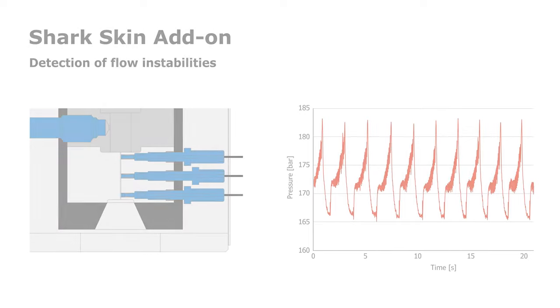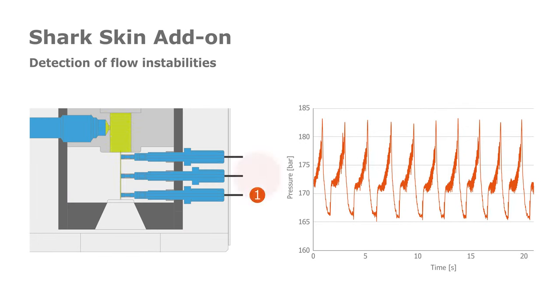Sharkskin can be measured directly by our sharkskin die. The sharkskin die is a slit die which consists of three fast acquisition pressure transducers, which allows an effective detection of flow instability, starting from sharkskin up to melt fracture.